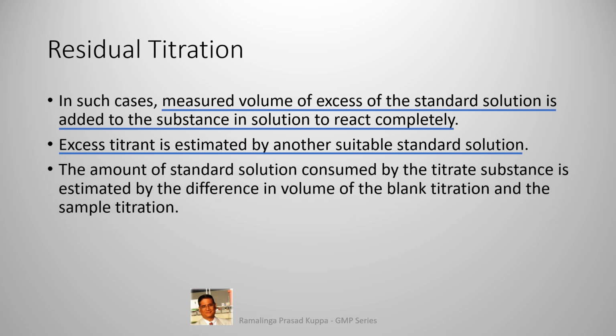The amount of standard solution consumed by the titrated substance is estimated by the difference in volume between the blank titration and the sample titration. In the residual titration method, a blank determination is carried out to estimate how much titrant reacted with the reactant.